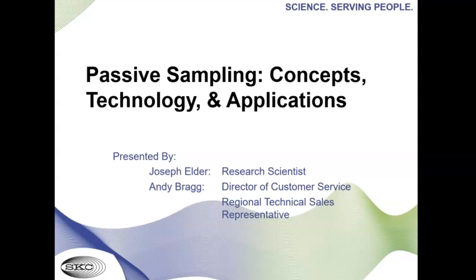Our technical experts will share the basics of passive sampling, how to calculate sampling rates, and some information on passive sampling technology available on the market and its applications for IH and OEHS professionals.